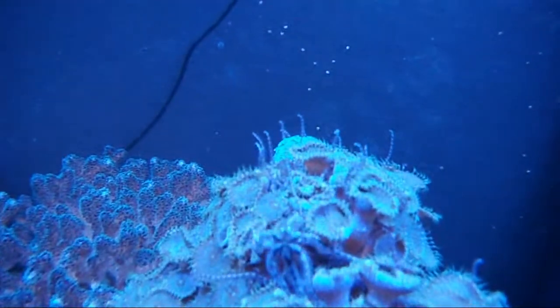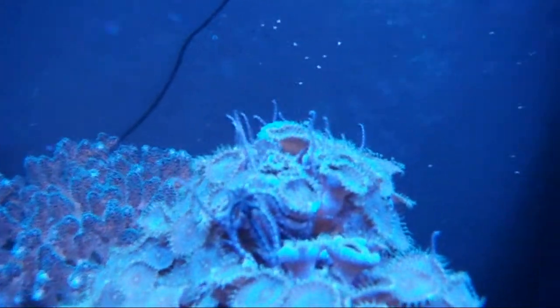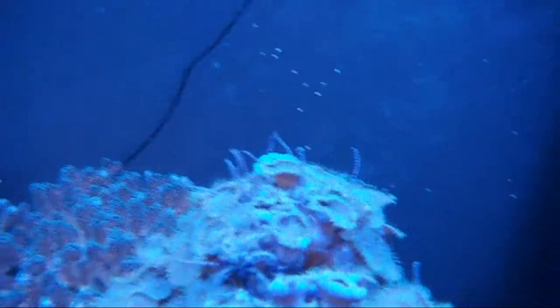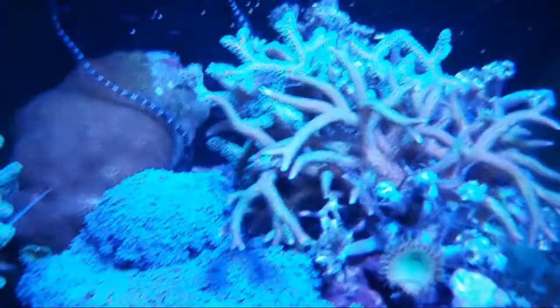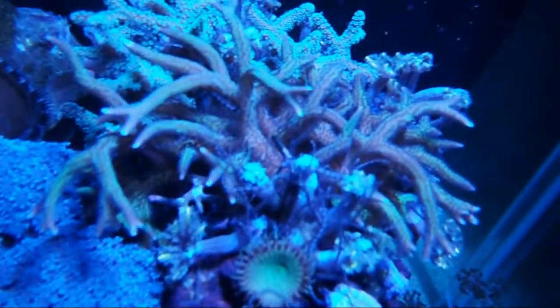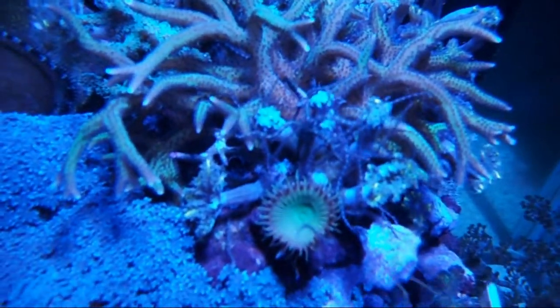As you can see from the other video, they're not very large. These little feet, this is what you generally see. Here's one kind of coming out. You can see his body, his disc. Anyway, what I wanted to show in the microscopic version is that these tiny, tiny little things have detail to them that you never get to see.